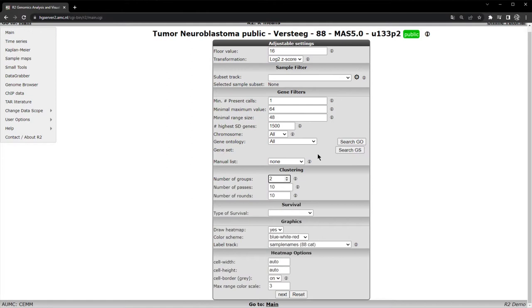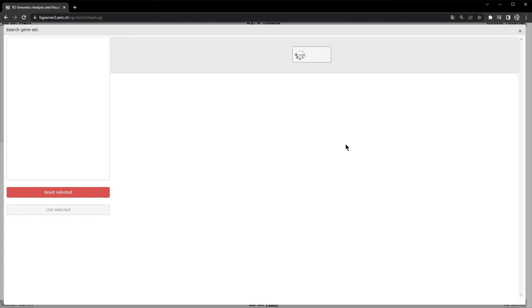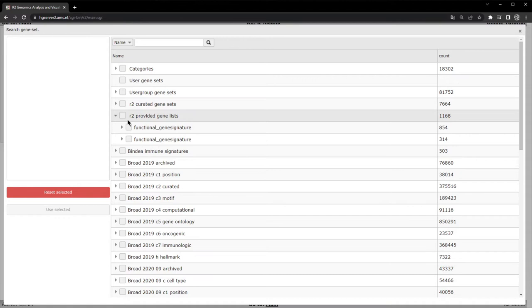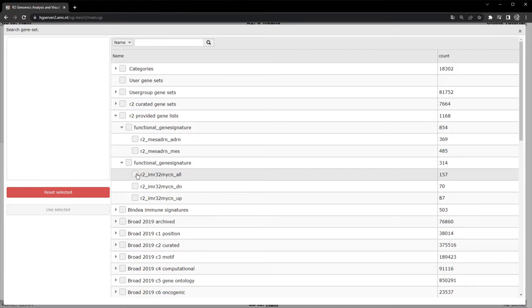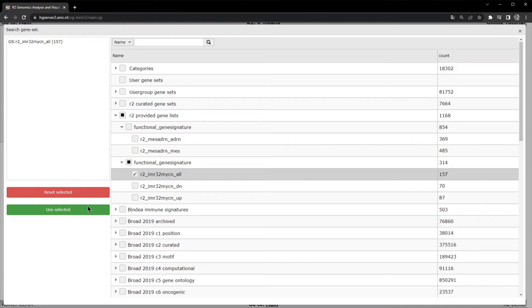We're going to be dividing the dataset into two groups based on the expression of a specific gene signature. Under gene filters, we're going to select our gene signature, and under gene sets, we're going to select R2 provided gene lists, then functional gene signatures. You'll see a gene signature labeled IMR32-MYCN-ALL, consisting of 157 genes.